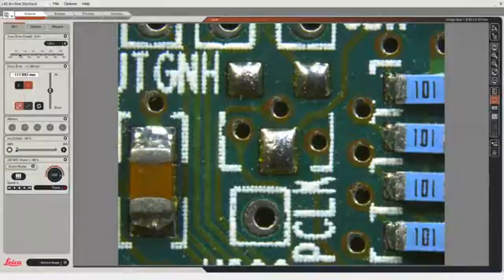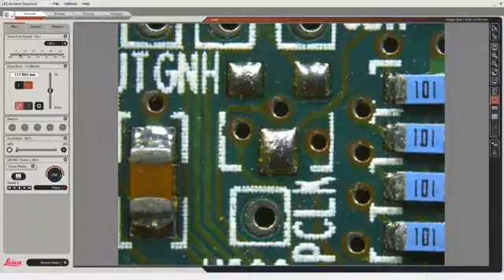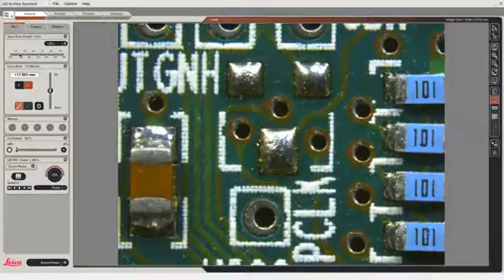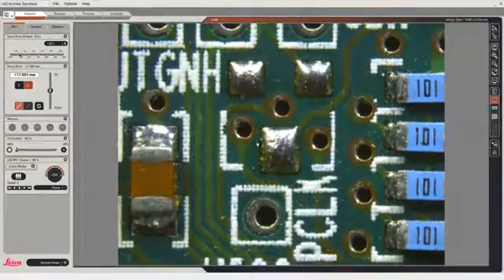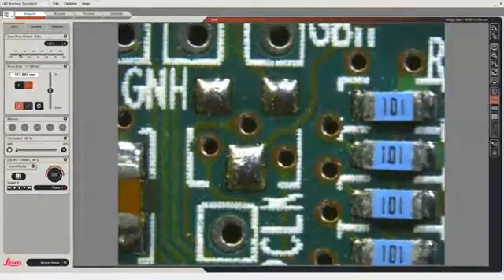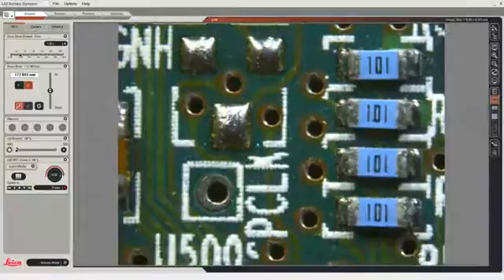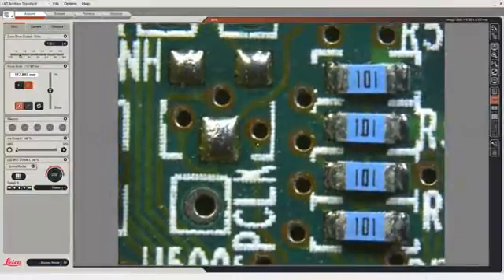You can see on the screen the image that it's currently displaying. The first thing we need to do is adjust the specimen so we can see on the screen the part of the image that we want to capture.